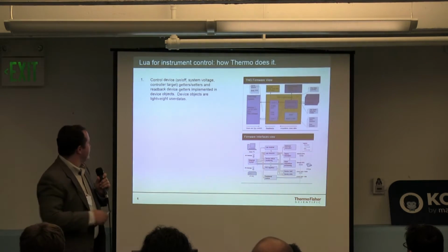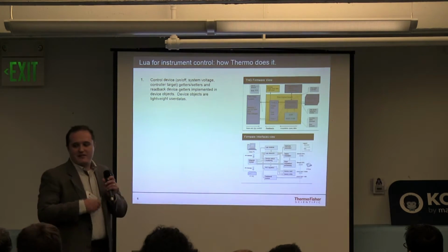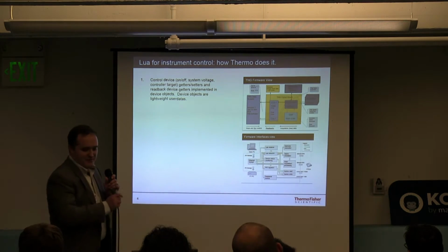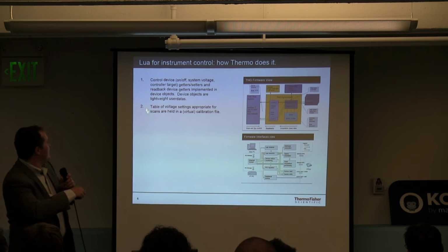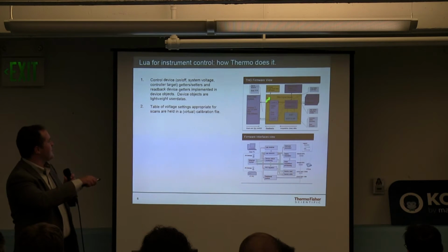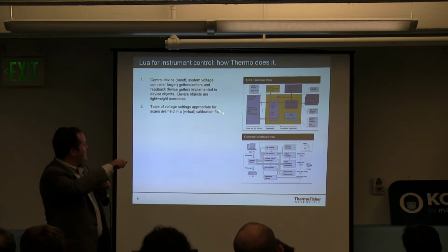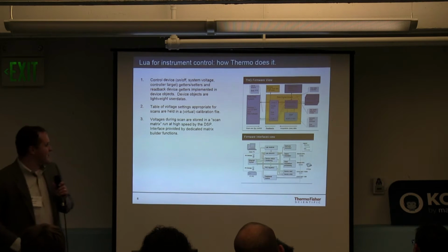So we have to implement this, and there are 5 parts to do that. First, access to the individual devices, whether we have something on or off, system voltages on the lenses, the getters and setters, implemented as objects corresponding to each device. We have a table of voltage settings that the DSP sees when it has to scan very quickly, much more quickly than if we were setting things manually from the Lua. So we control these separately. We have non-scanning voltages, and then we have scanning voltages. But those are also exposed to Lua, so we can change them between scans.